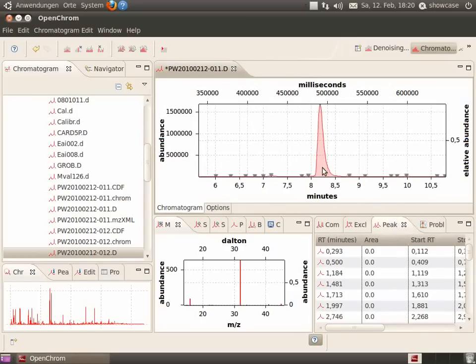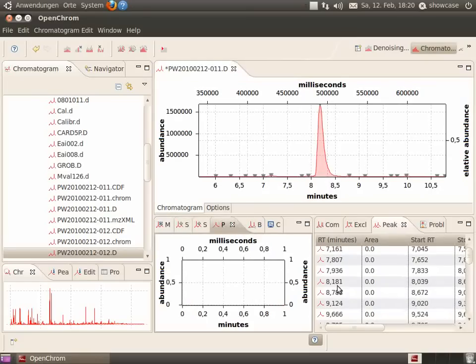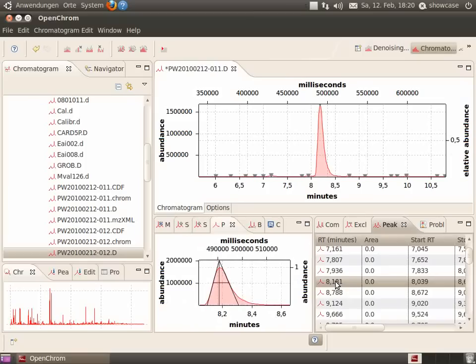Further on, you can see a single peak by choosing the view and selecting a peak from the peak list.